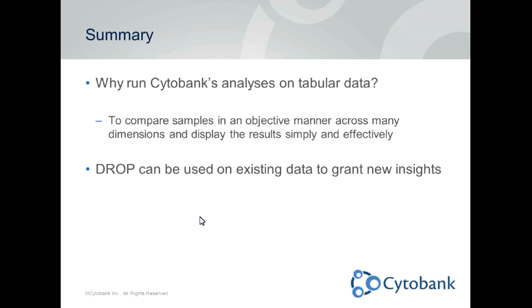So in summary, why would you run Cytobank's analyses on other data types outside of cytometry? The answer is to compare these samples in an objective manner across many dimensions and display the results simply and effectively. These tools are very simple to use, especially if you're already used to using Cytobank. That's the goal.